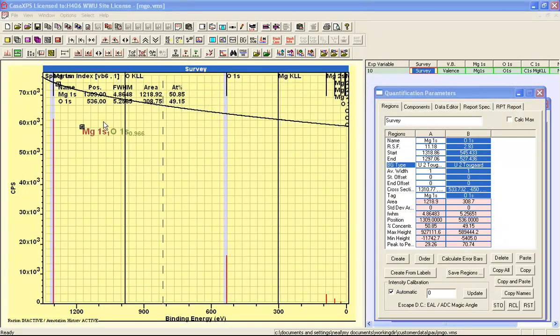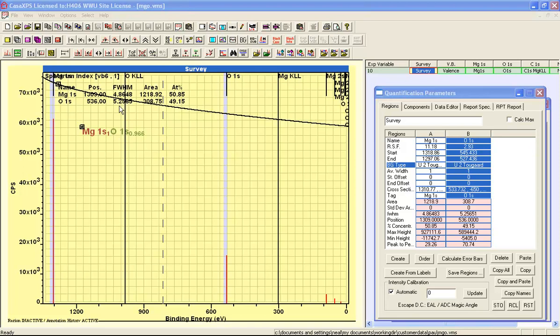The transmission clearly has an influence on the quantification. However, in this case, because we have very low kinetic energy and very high kinetic energy peaks, the escape depth makes an important contribution to obtaining the correct stoichiometry for this magnesium oxide.